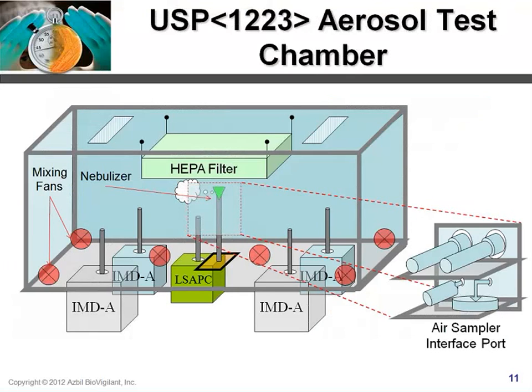So let's look a little bit more at the chamber that we used. This is a schematic of the 2.9 cubic meter purpose-built chamber in Japan, which was designed with a specific goal of testing and validating these aerosol rapid micromethods. The chamber itself was designed for compliance with and validated to multiple standards out in the industry, including a couple Japanese standards, 3836, a couple ISO standards, including 14698 and 14644, and several others.